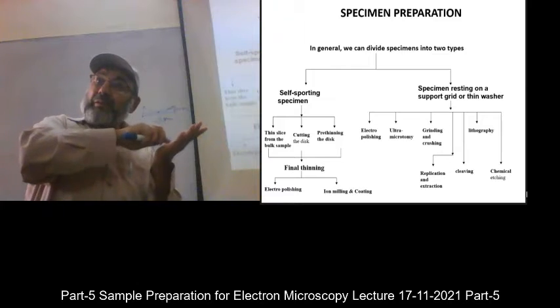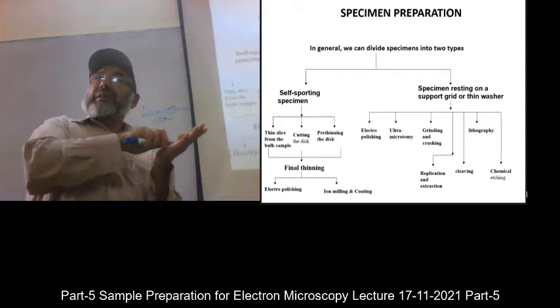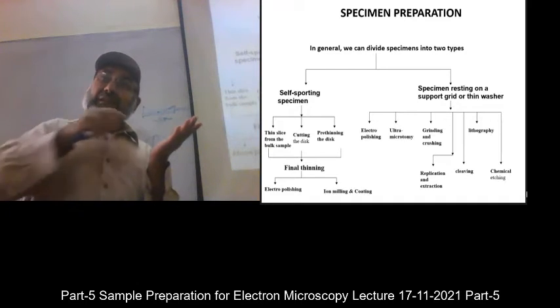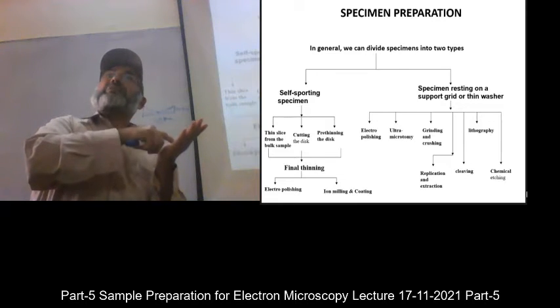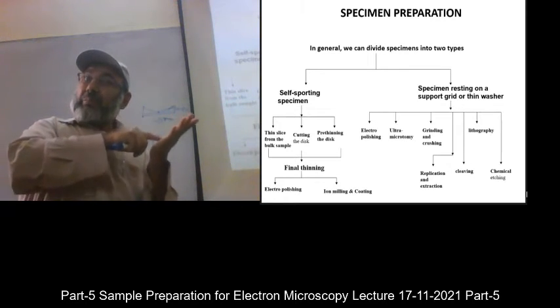It rubs the paste of diamond with the sample, and very softly it is grinding the middle of the sample. Because if it is a wheel, not cloth, then it will scratch the sample and there is a chance that it will break. And the wheel cannot cut it. It is the diamond paste which is polishing it.